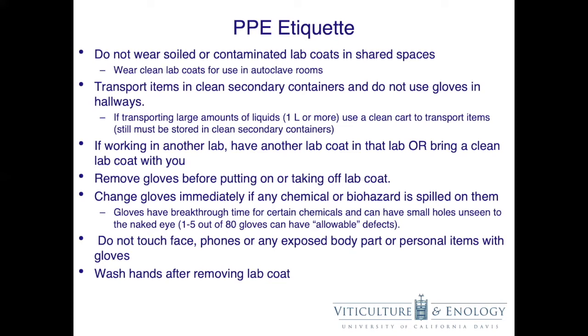If you are transporting something to a different location in the building, your items must be stored in a clean secondary container. Do not use gloves in hallways. If you're transporting large amounts of liquids, use a clean cart to transport your items to avoid dropping and spilling. These items must still be stored in a clean secondary container.